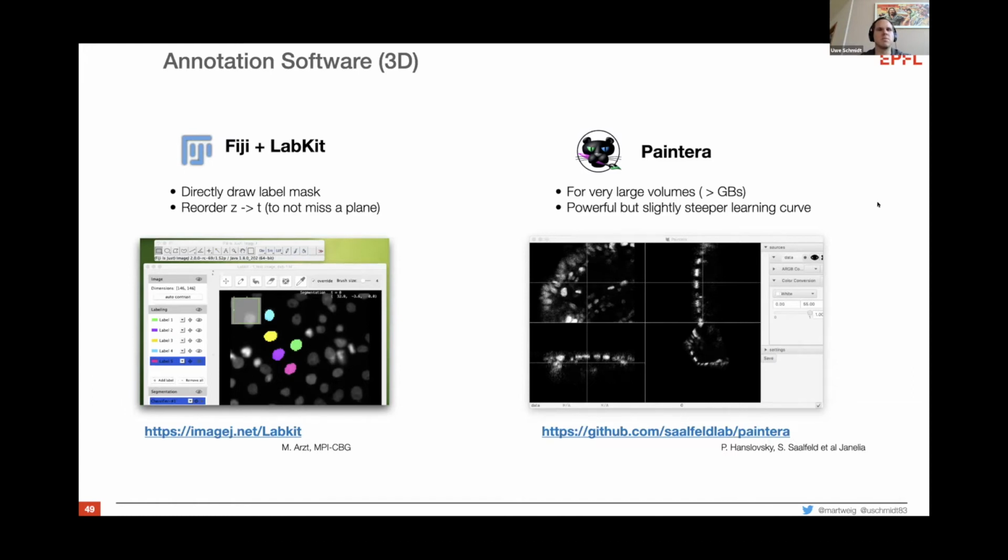Like when we did a session on Monday, in some sense, if you imagine every slice is a detection, and then you treat the Z slices as time, then use a tracking framework to combine the different slices. In some sense, that could probably work, right? If you take the detections and load them into a tracking framework, maybe that will actually do a nice job of merging the different segmentations from the different slices. Yeah. Could be, I don't know, we never tried it.